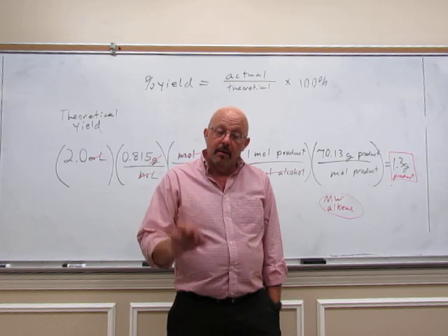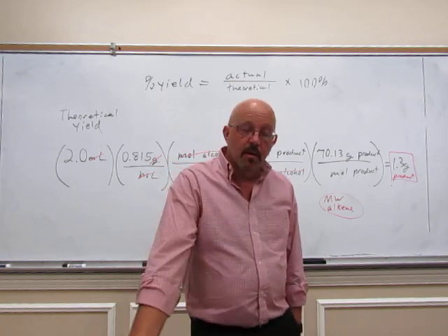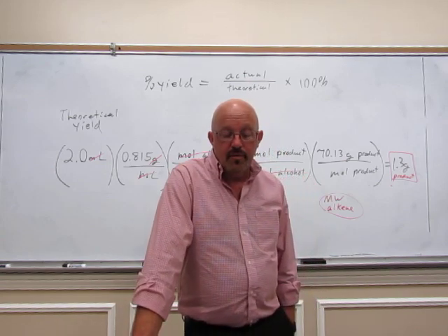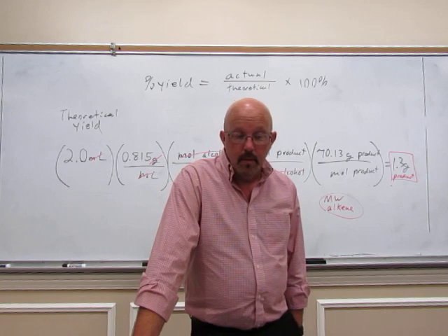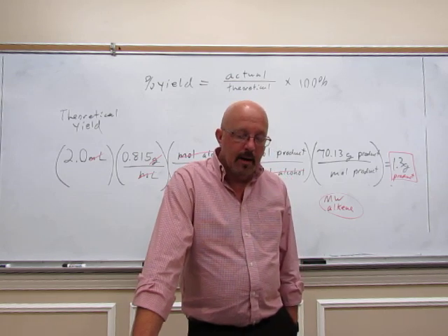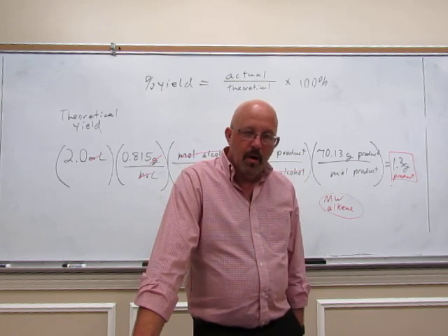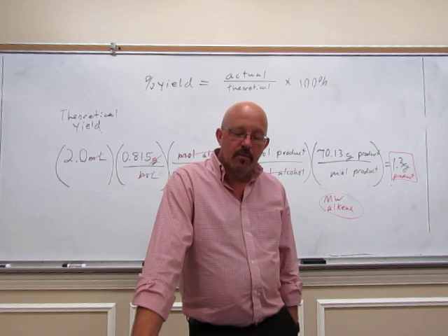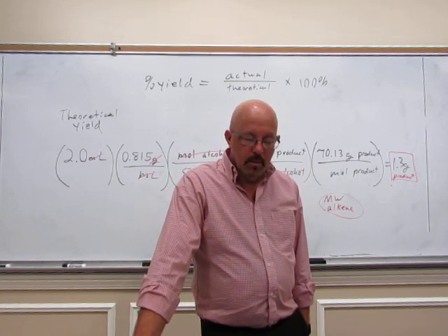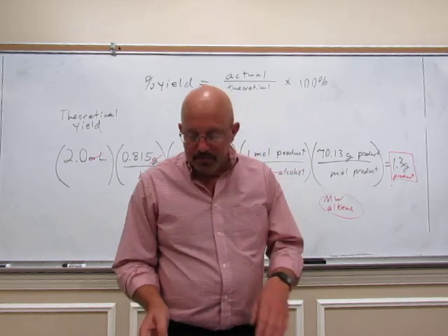They might still be a little bit in there. And we'll know if your reaction didn't go to completion. So that disappeared. You should see sp2 CH stretching appearing because we're making an alkene. And you should also see a carbon-carbon double bond stretch. That should be appearing. So talk about those, where they're located. So that's how you discuss an IR spectra in your conclusions.